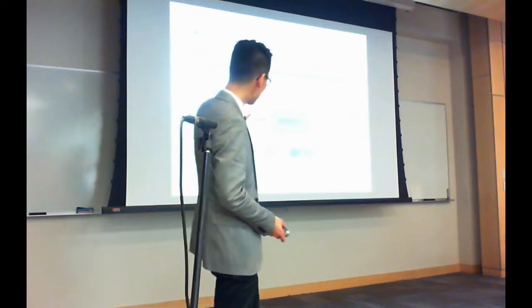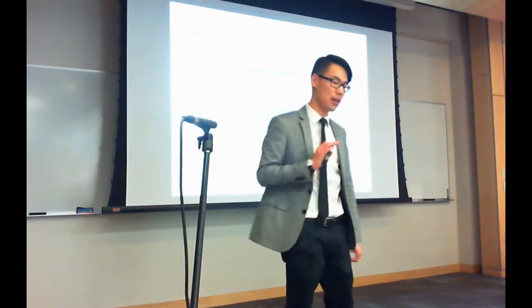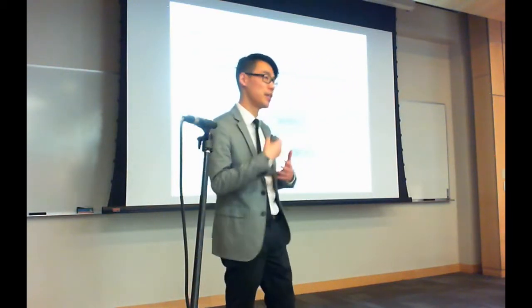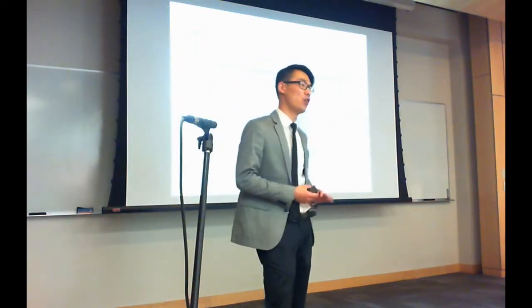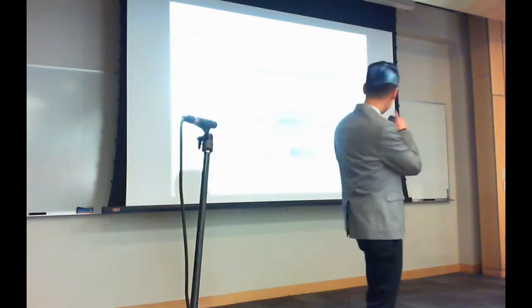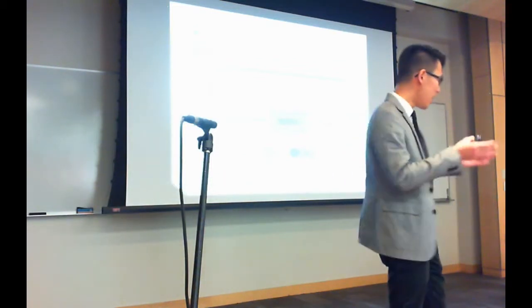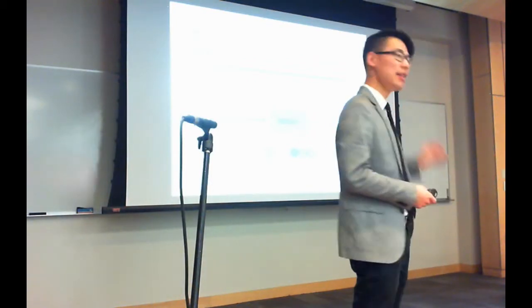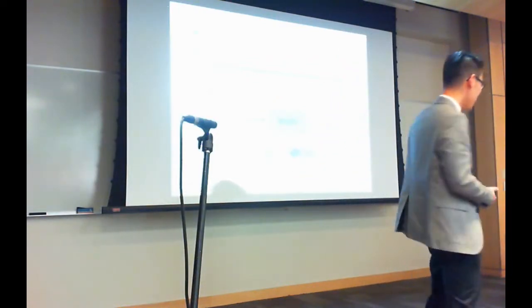And we searched it with a tool out there, a database tool, that allowed us to assign identifications to all these spectra, peptide identifications of these spectra. And just for using this one tool, it was slightly over 100 CPU years of time. And at the end, we end up with 208 million spectra that are identified. And the problem is, we could take these identifications, put them all together and say, hey, we have a library, and do that naively.